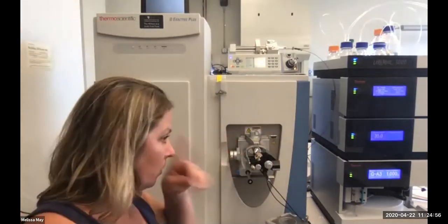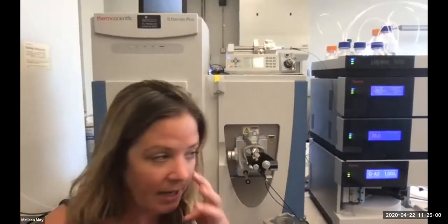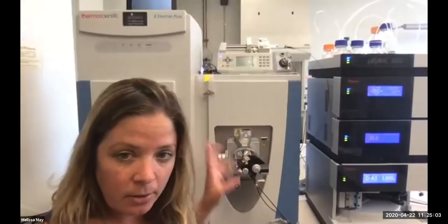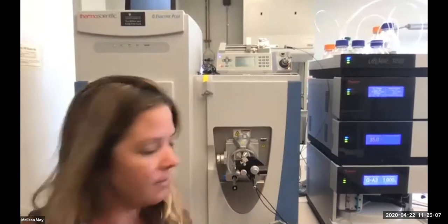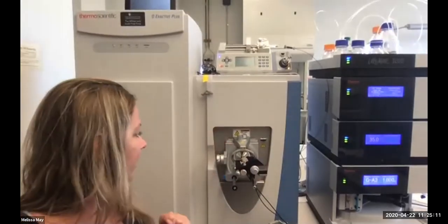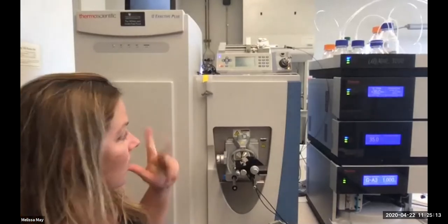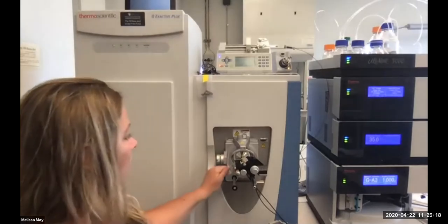When you take the source off or on, the instrument will automatically tell you that it's put itself into standby, and that if you don't put it back on within an hour, it's going to shut the instrument off. This is because you're opening the source. Basically, you have really high electrical current going in here, and you want to keep the system closed.